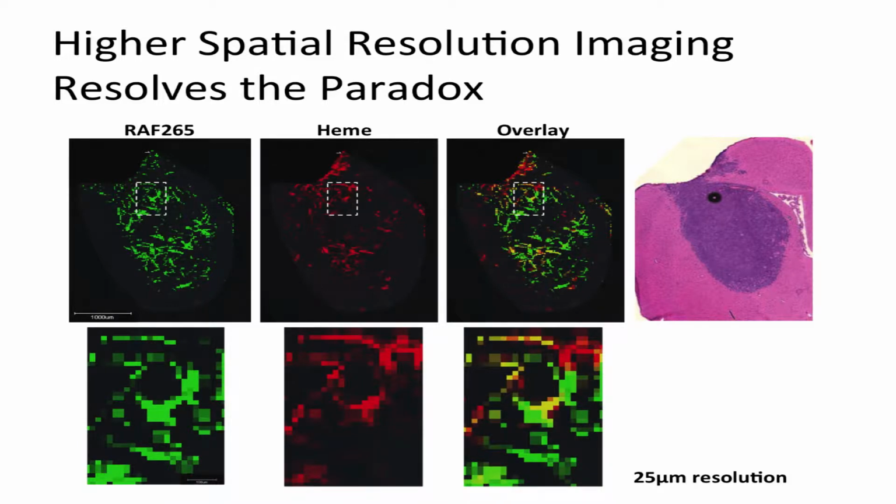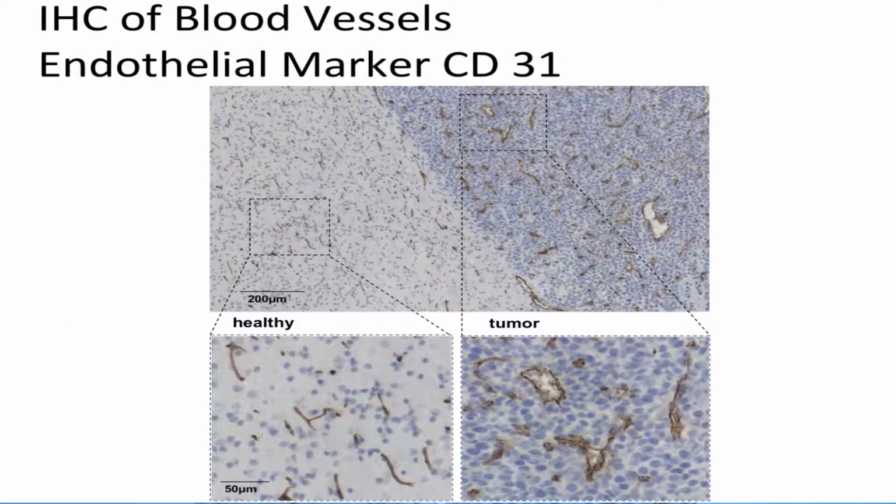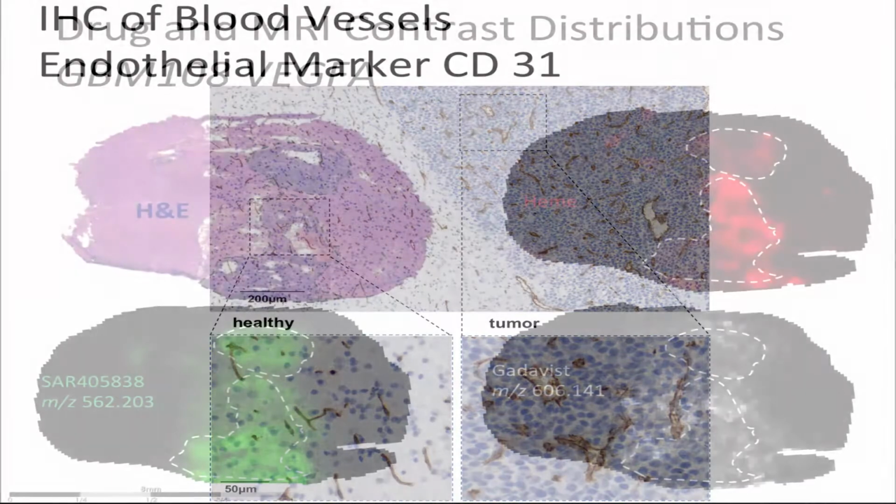So what we're seeing now is a spectrum of drug distribution that seems to be affected by both perfusion and diffusion. And if you look at the CD31 stain of this animal, you see those bloated vessels. Some are dead-ended. So if you have a rush of drug going there, it might just be accumulating in here without being able to go across the vessels.